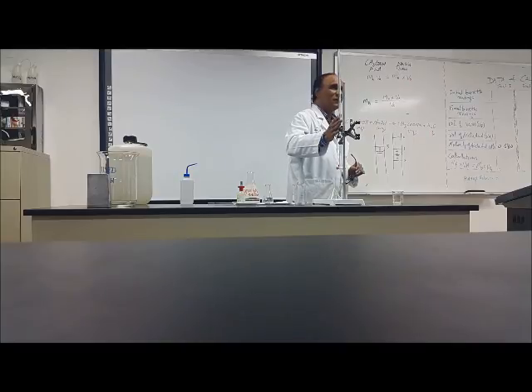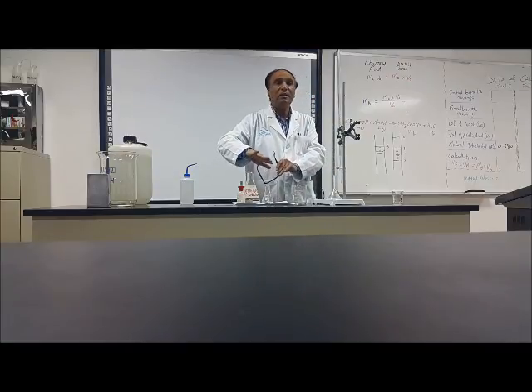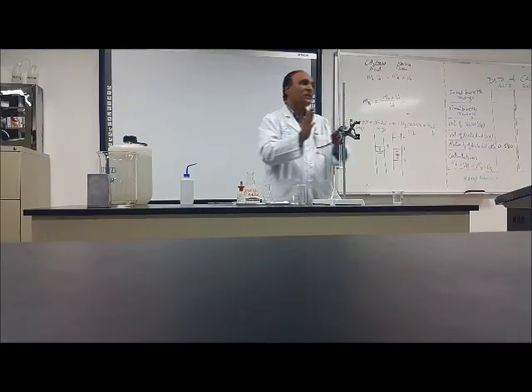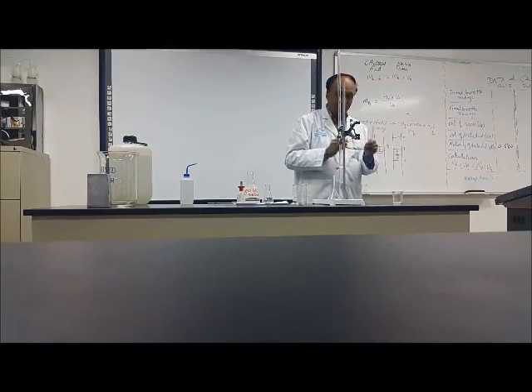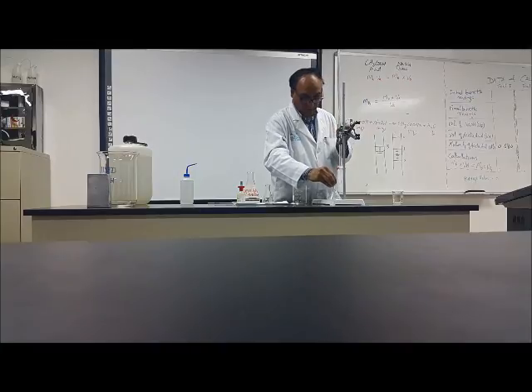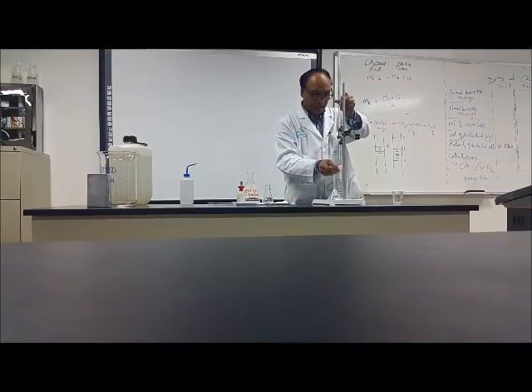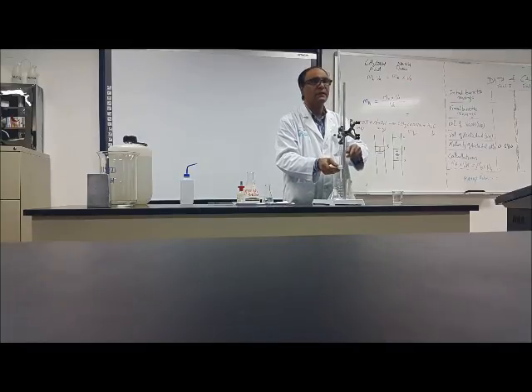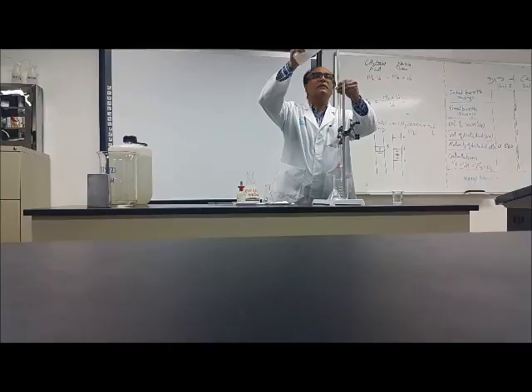What will the other student do? The other student will not wait for him. The first student, maybe he will take 5 or 10 minutes. In those 10 minutes, the other student will fill this one. How to fill this one? Take the pen out. You put a beaker, not this beaker, another beaker, and wash it with water and move this one.